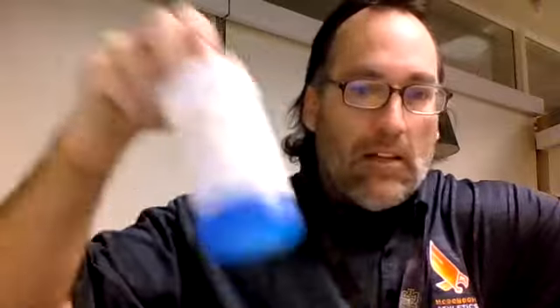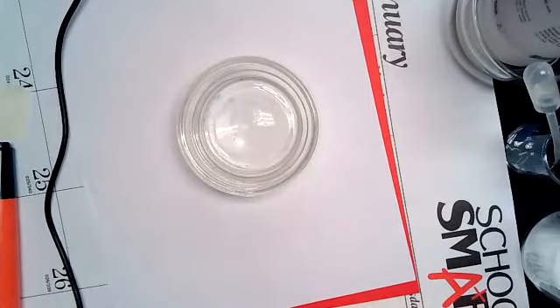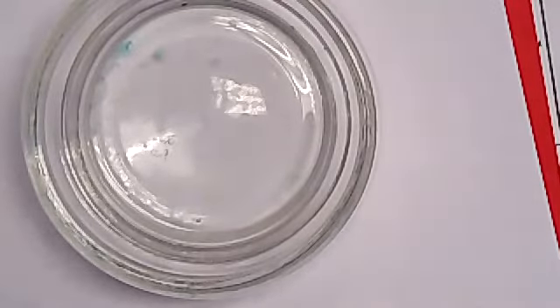Our second one that we're going to take a look at is with two different solutions. One is copper sulfate, this is copper sulfate here, it's a blue solution, and ammonia is the other one. I'm going to mix these two liquids together, and in order for you to see this more clearly, I'm going to show you the desktop. All right, so here we have our dish, and let's go ahead and kind of zoom in there. All right, so ammonia is a clear liquid. It's a household cleaner used to clean like toilets and floors and things like that.